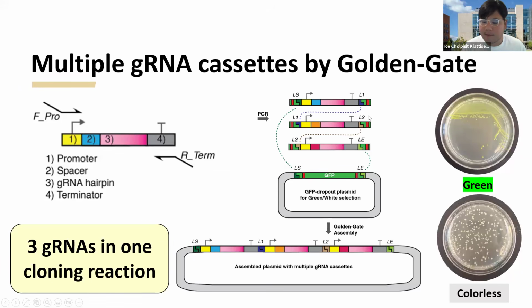I'll put some links that were very useful in the recording description as well. I think the site that I appreciate a lot, where I learned from, is the site from Jeffrey Barrick Lab at UT Austin, where they have a wiki style that shows how to do these processes step by step.